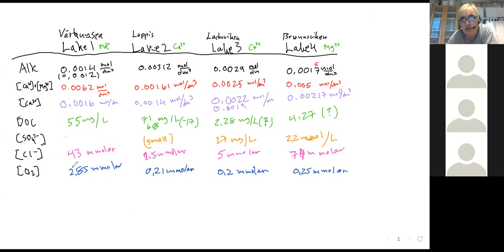Maybe it's difficult to, but the conclusion for the chloride ions is that they're high. And did we measure any other parameter, by the way? I think for Lake 4, the chloride ion should be 7.4 millimolar. 7.4, yeah, not 74. But it's still less than the Värtan value, but higher than the freshwater lakes.